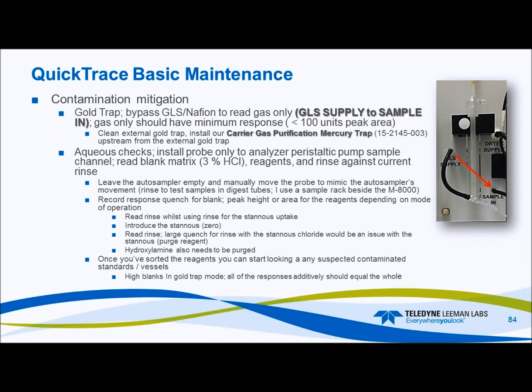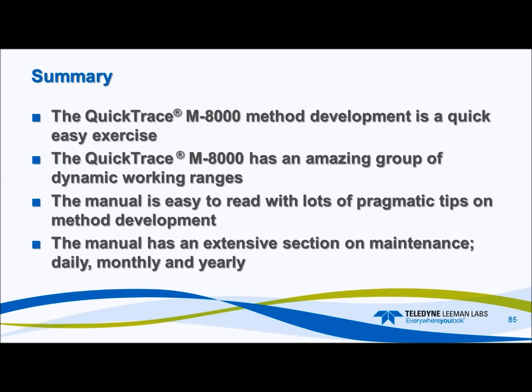Also during gold trap analysis, if you do the same process, you can see where your contamination is coming from: the rinse, the makeup standard, the stannous chloride, and so forth. You can see where you need to address the system to keep it all in control. So that's kind of how I do the troubleshooting. And if there's questions on troubleshooting and how to source contamination, by all means, give me a phone call. We can go through it in depth more than on one slide in a webinar. So again, I'm sorry for the overage of a few minutes, but hopefully it was worth your time.